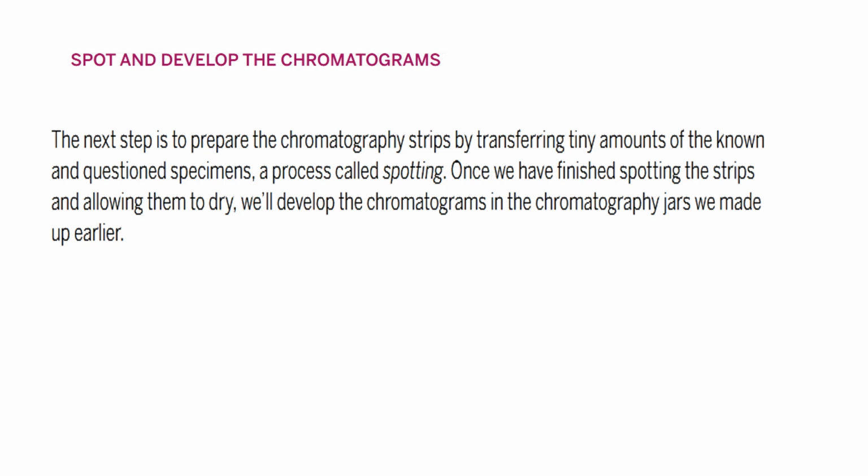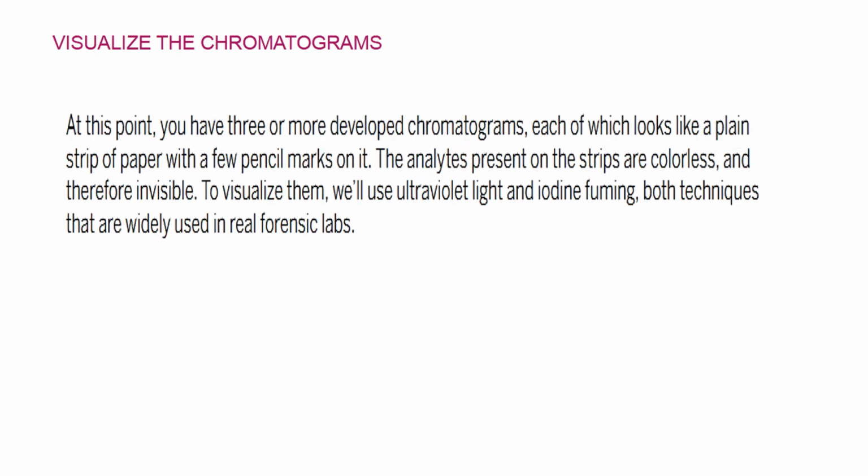So this is the way we are plotting, and that is the spotting and developing the chromatograms. Next, how to visualize the chromatograms.